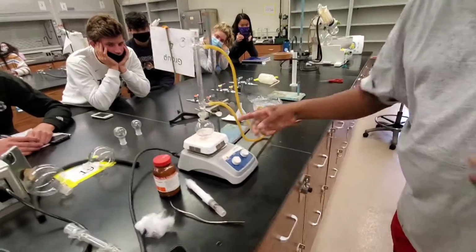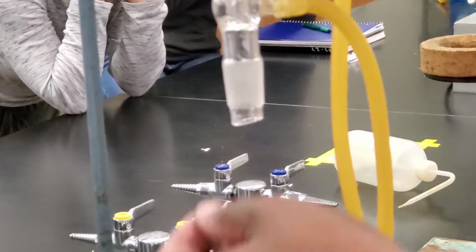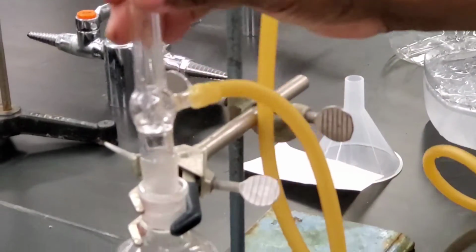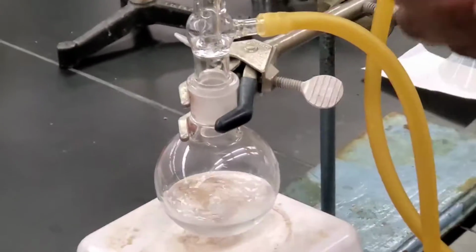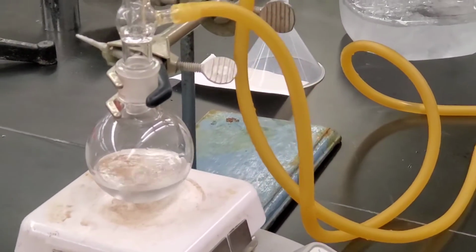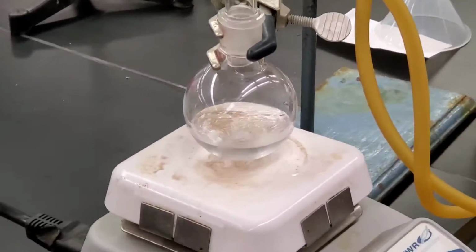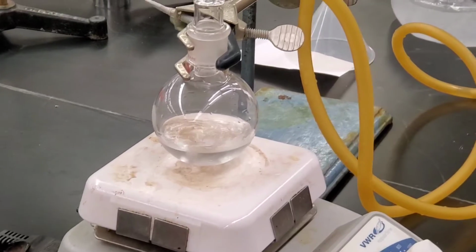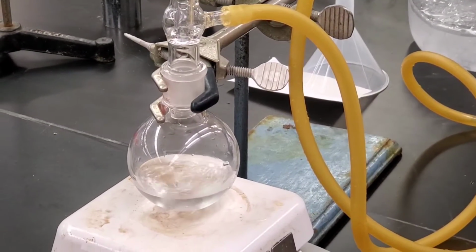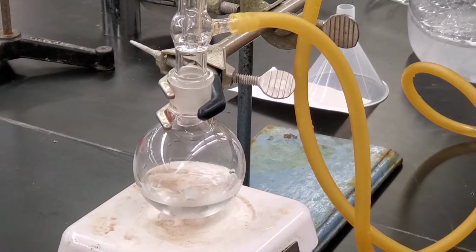It condenses, and then it starts dripping. At the tip here, you're going to start seeing drips. That's not water, that's actually a solvent that has evaporated, condensed, and is dripping back in. The first 2 or 3 drops, that's when you start counting the time. So if the reaction says 3 hours reflux, 3 hours reflux doesn't begin when you turn this to 400. 3 hours begins at the first 2 or 3 drops from the tip of the condenser.